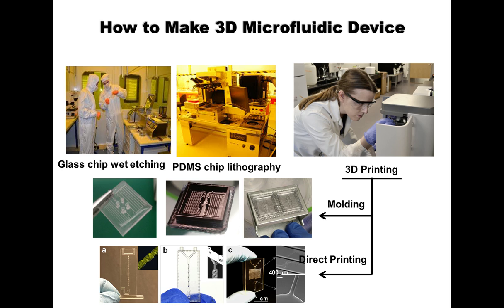And we use a benchtop, consumer-grade 3D printer, and we can print the mold to mold the PDMS polymer. Also, we can directly print the microfluidic channel.